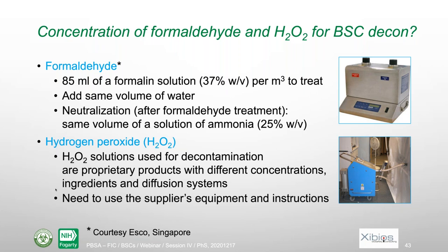The next question was about the decontamination of biosafety cabinet, and it was about the concentration of formaldehyde and H2O2 for that purpose. For formaldehyde, I can give you the recipe. It's here. And it's the same everywhere, even if I got this information from ESCO in Singapore. It will depend on the volume of the biosafety cabinet, and you need to reach a concentration. Also, you need to have some neutralization to avoid having formaldehyde remaining on the surface and in your cabinet. That's easy with formaldehyde, and you have very simple equipment.